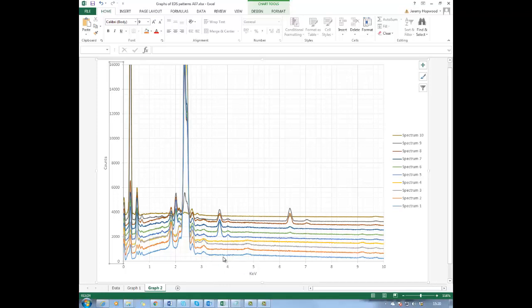So 400 looks fine there, 400 looks fine for that one, 400 for that one here, but this one, because it goes close, I would say the next offset is not 400 but 800. So maybe when you're doing these graphs, it's better to do the offset each time, and maybe set it at 16,000 times and then do it that way.